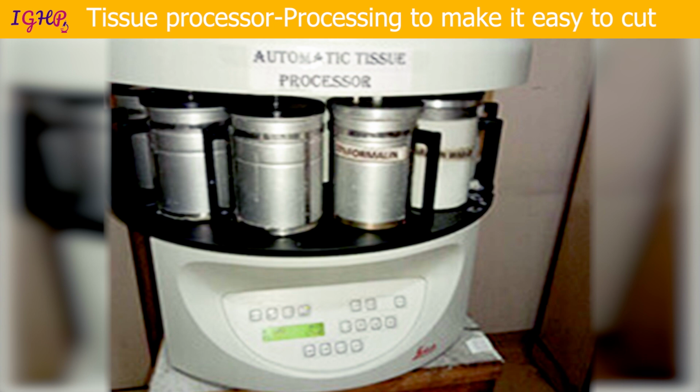In the processing, what is taken care of is removing all the water from the tissue, and this water is then replaced by wax. The idea of doing this processing is basically to remove the water content from the tissue and replace it with wax so that it can be easily cut under the microtome. We do it in various stages: for the first 2 buckets, you use formalin so that the tissue is well preserved. Thereafter, the water content is removed with the help of increasing grades of alcohol. That is called dehydration.